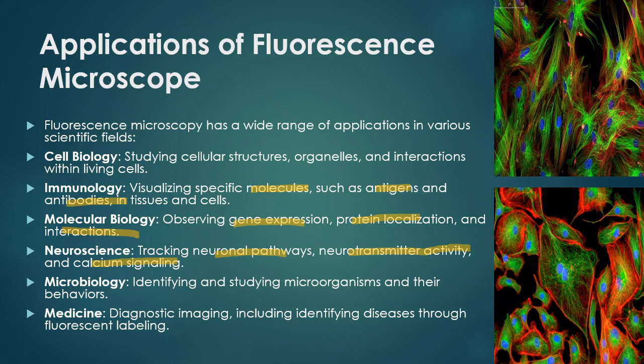And then in microbiology, we mainly use this microscope for studying microorganisms. We can also study their behavior here. And for medicine, like diagnostic imaging, including diseases and fluorescent labeling, all these things are applications of the fluorescence microscope.